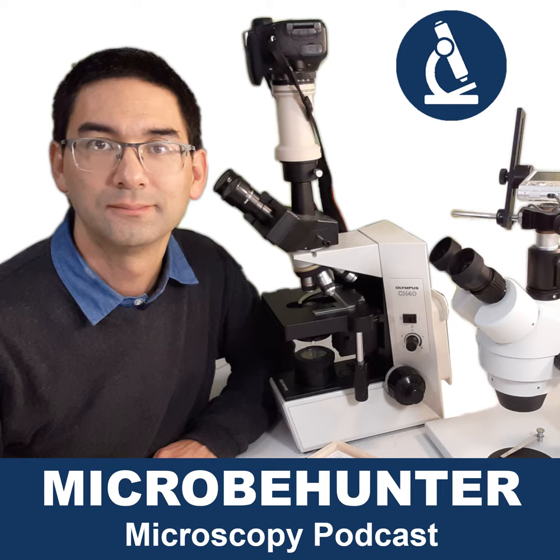Interesting. Right now, if you look at the four big microscope manufacturers, Olympus, Zeiss, Nikon, and Leica, they have all switched over to infinity optics.